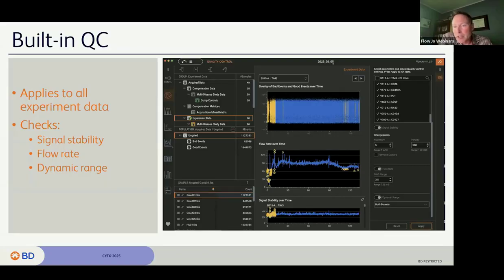If you want other QC tools, we will at some point either build some of them in or connect the plugins back. I've spoken against plugins a couple times. I love plugins. I saw that on the Reddit thread that someone was like, the FlowJo people hate plugins. I love them. They're just a little hard to give out and maintain, particularly for anybody in a regulated environment. So I hope this makes it easier for you folks who don't maybe have admin rights on your computer, and we will figure out a good way to make plugins happen in the future where you don't have to control that. So for now, if you want to QC, it's just a button, does it all.